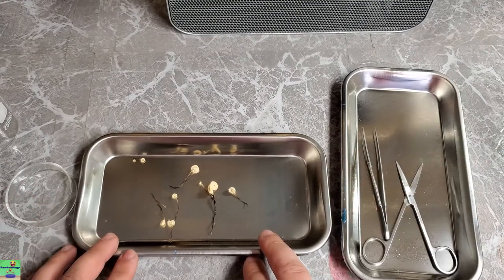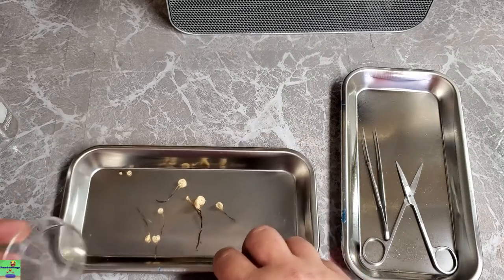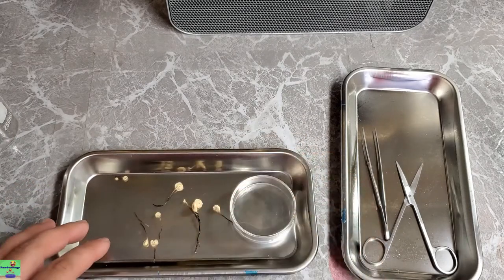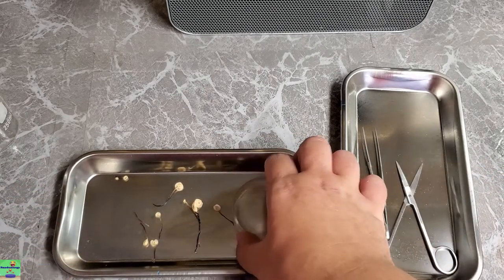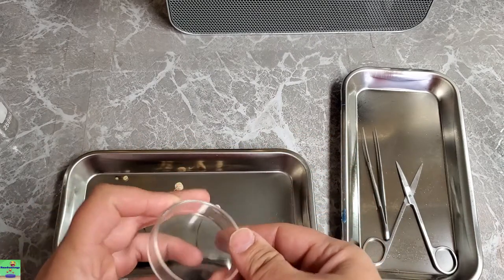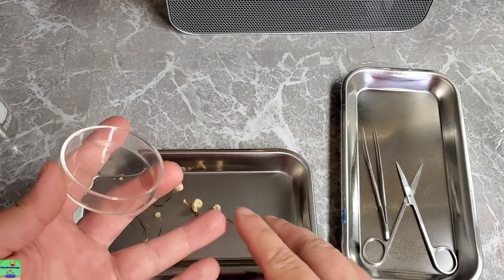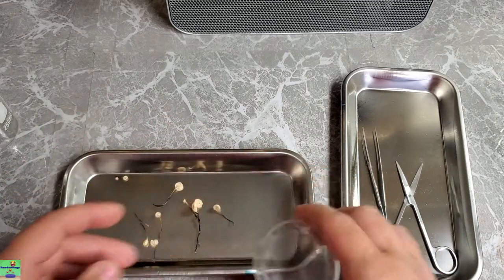But I figure I may as well go ahead and do a quick spore print sample, how I do it at least. Now, all you need to do is make sure that you have a clean vessel. I like these little glass petri dishes. You can use a styrofoam plate, or you can use a piece of aluminum foil.